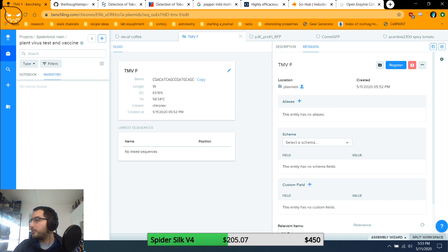There's a question. Are there commercial products to counter the virus? Flamethrower. It's true. We have nothing. If you've got a virus, you get a flamethrower and you light all your plants on fire and you hope that it doesn't spread. So I'm going to actually recreate that oligo again.